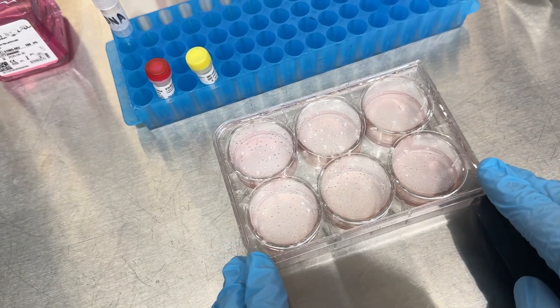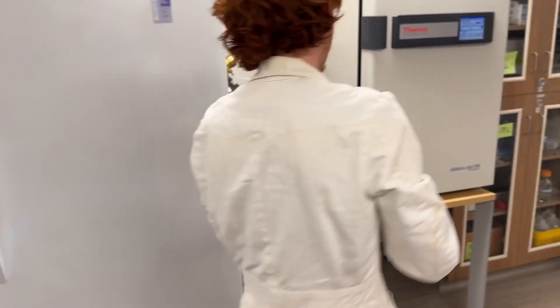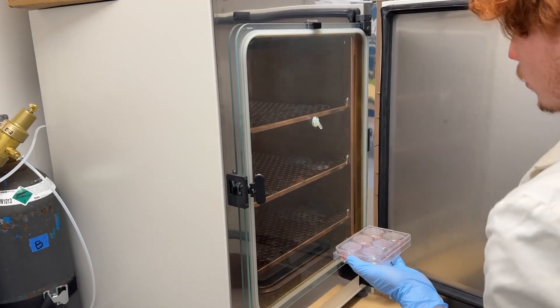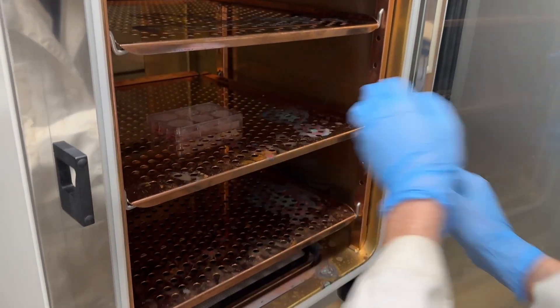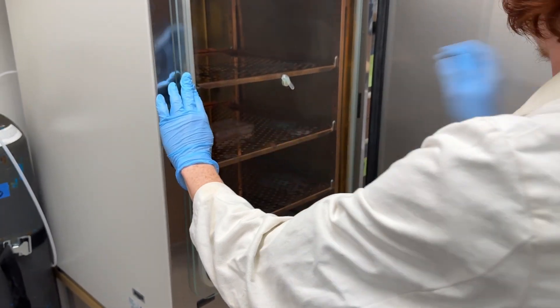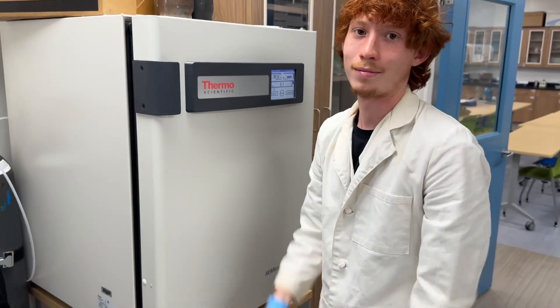That's it — this is about as simple as a transfection gets. A little swirl if you want, it's not necessary but sometimes we do it. Now we take it back to the CO2 incubator, which keeps things at the right temperature and CO2 concentration. We place it in there, double-check the glass seal is right, and the carbon dioxide stays.